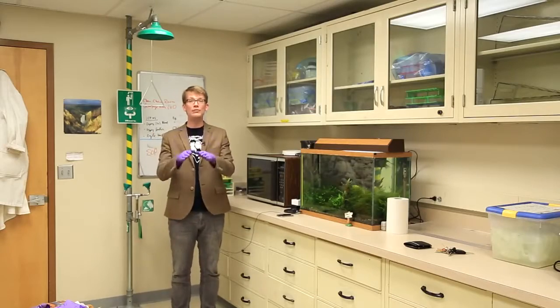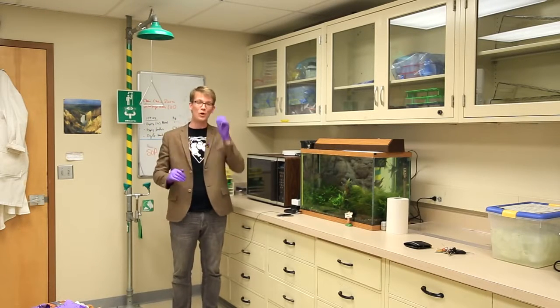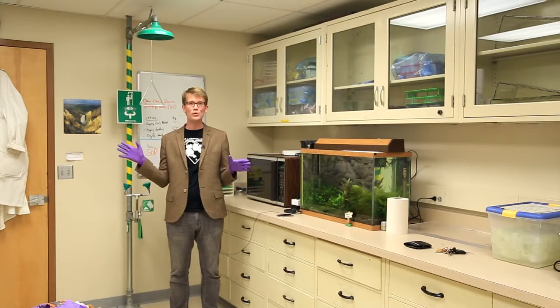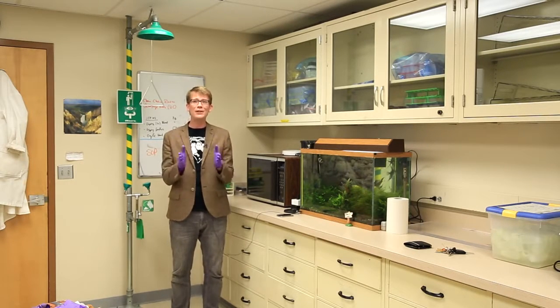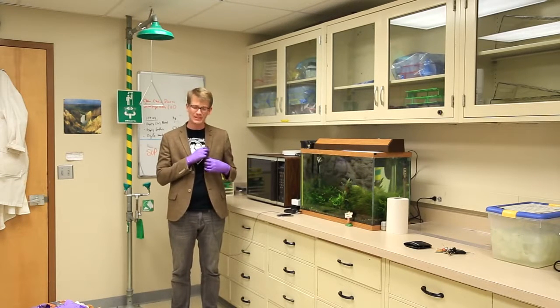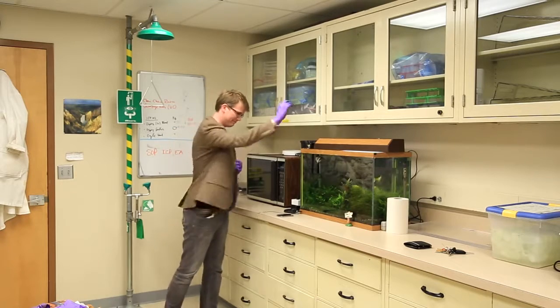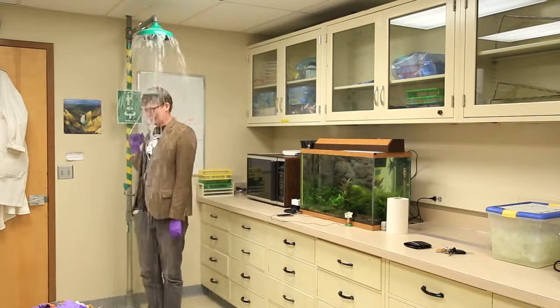Also, while you're taking them off, you might want to run over to this guy here. His job is to dump a gigantic amount of water on you really fast. Now, usually, you don't get to see these things in action unless there's an actual emergency, but to thank you for sticking with us through this somewhat disjointed lecture on safety in the lab, I'm going to take this off. That's a lot of water!